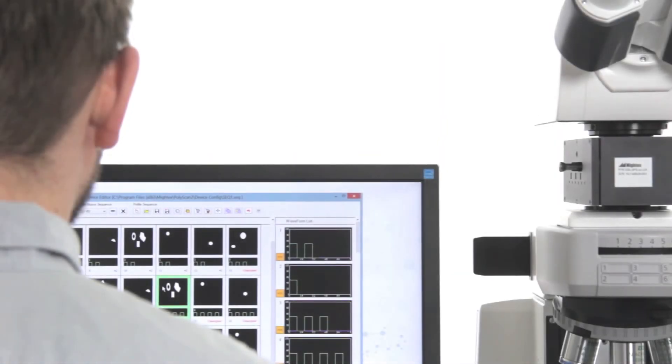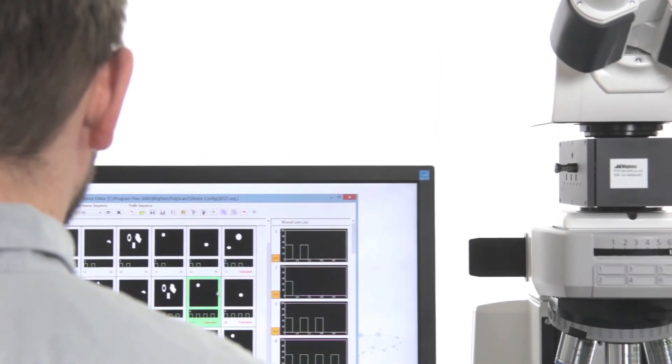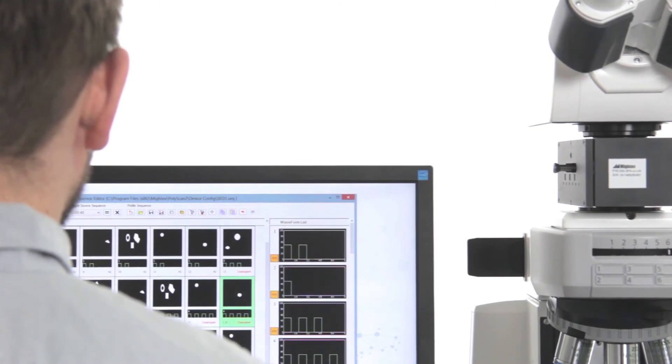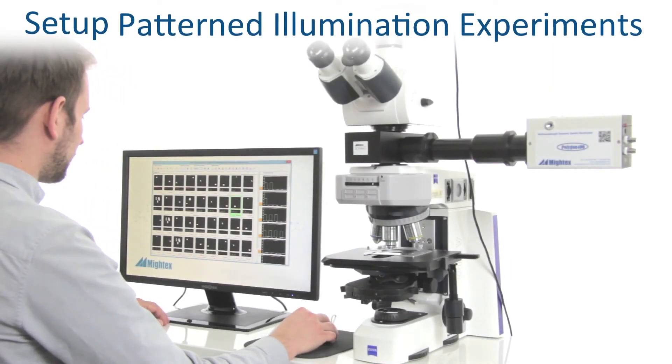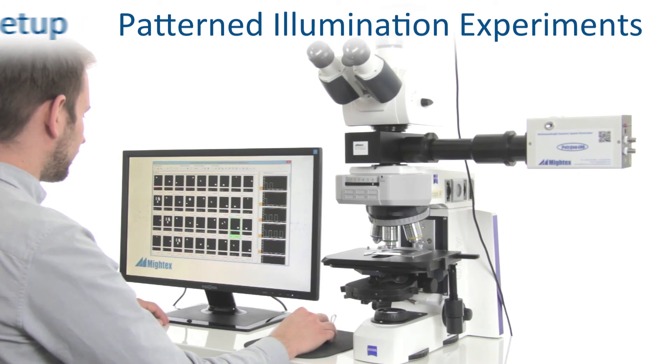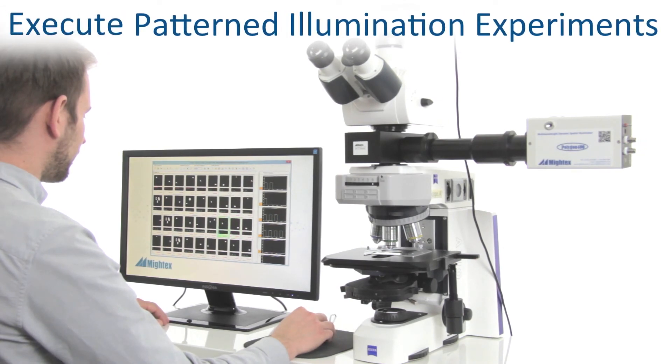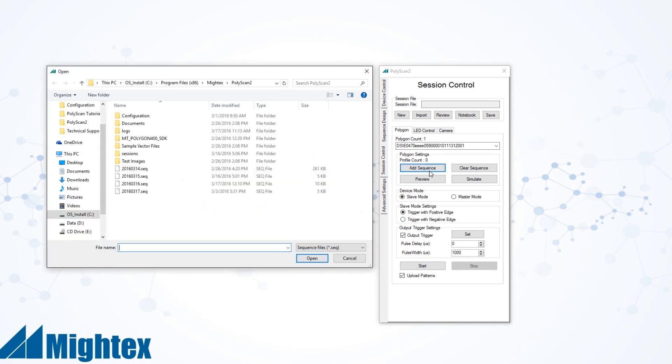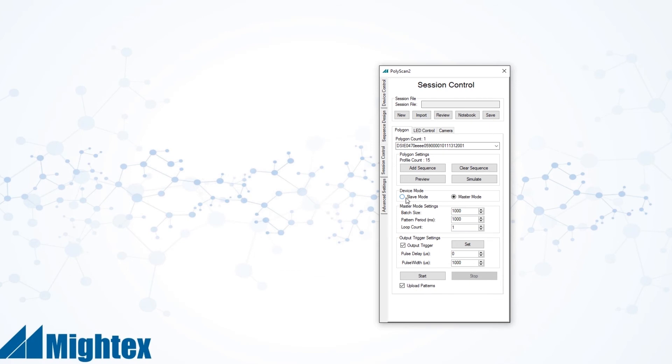In addition to all the tools that aid with defining illumination parameters, PolyScan also includes a session control, a powerful tool that helps users set up and execute their pattern illumination experiments. Through the session control, you can upload desired sequences and synchronize illumination patterns with other lab equipment by selecting TTL inputs or outputs.